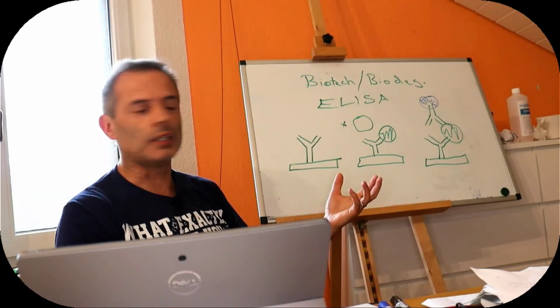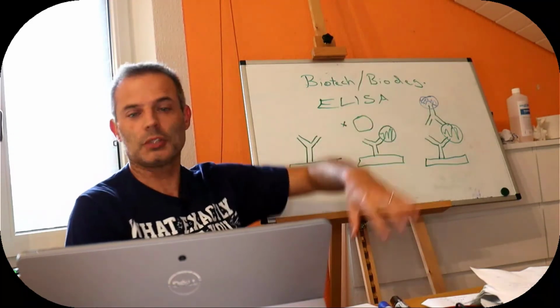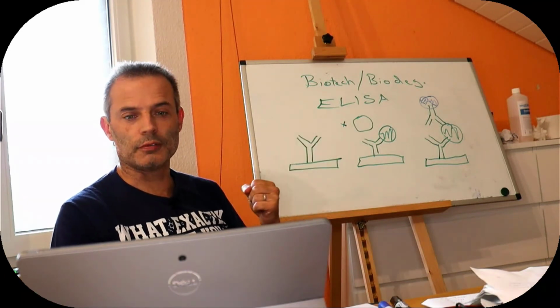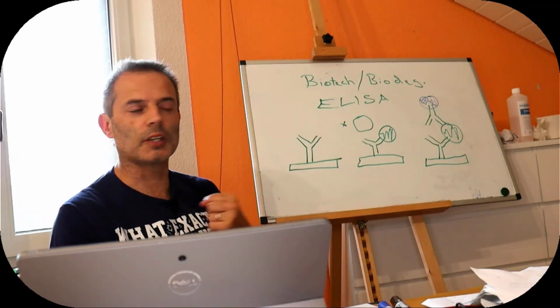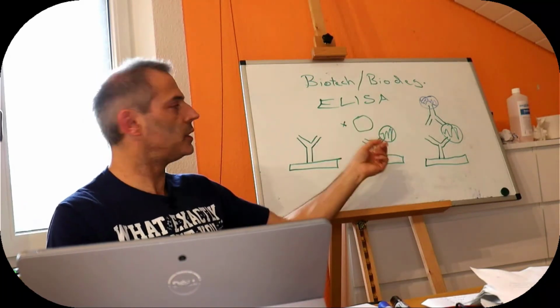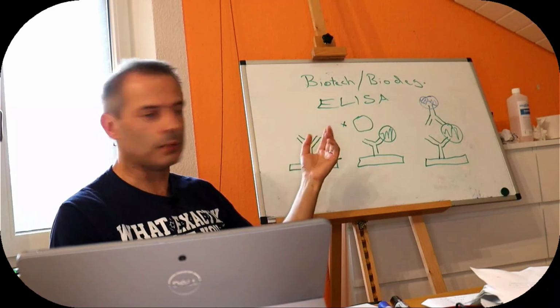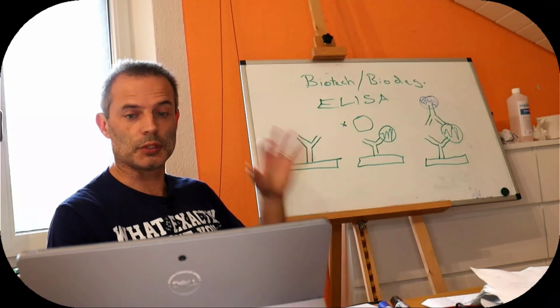The problem there is usually non-specific binding, that our antigen or our antibody can just stick to something, just generally. In the example that I've done in the lab, the protein that we put on the surface sticks by hydrophobic interaction. So that is relatively simple, it's easy to do, but the problem with hydrophobic interaction is it's completely non-specific. If we use an antigen, we don't know which way up it is, so some of the molecules won't be able to attach. Whereas this way around it's quite efficient, because the bottom end of the antibody, this third attachment point, is different to the other two, so we can use the chemical difference to attach it specifically in the right direction.